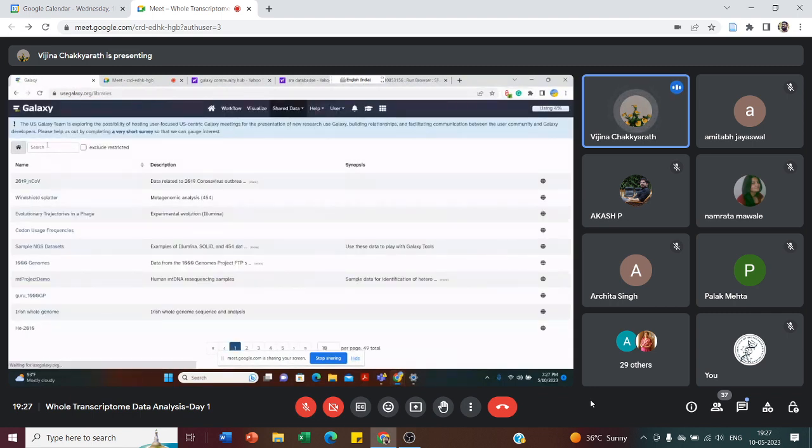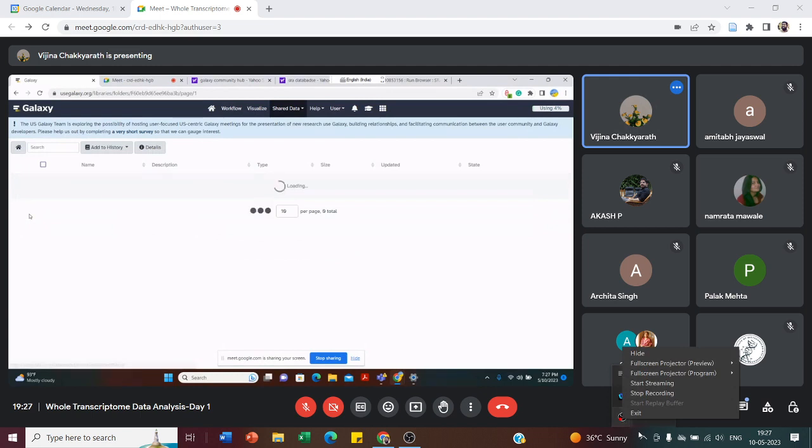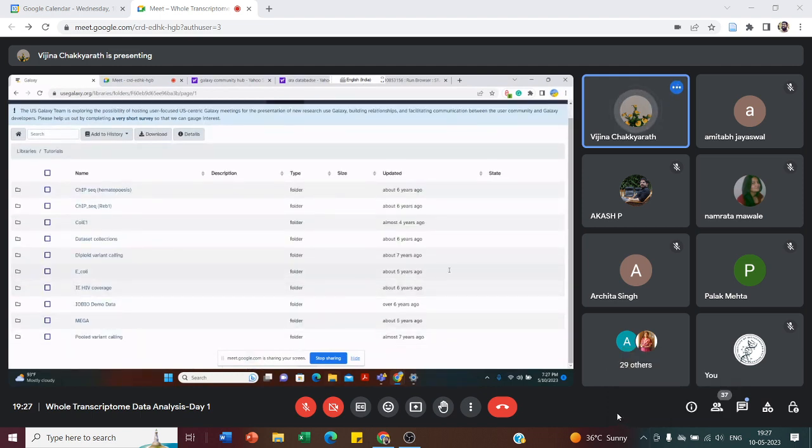Then you can type tutorials here. Go to tutorials. Then you will get.